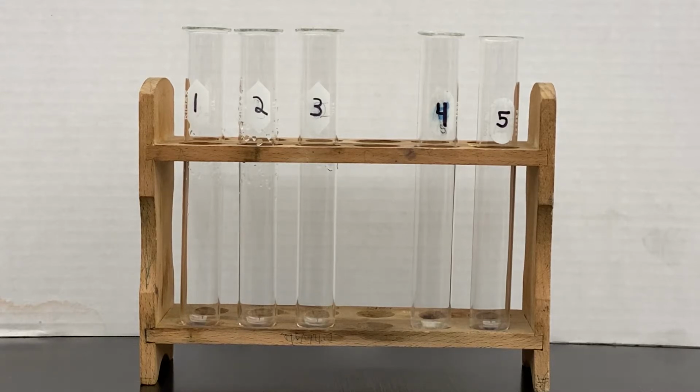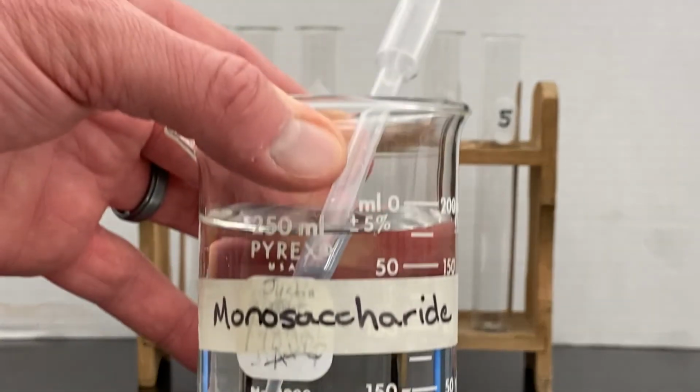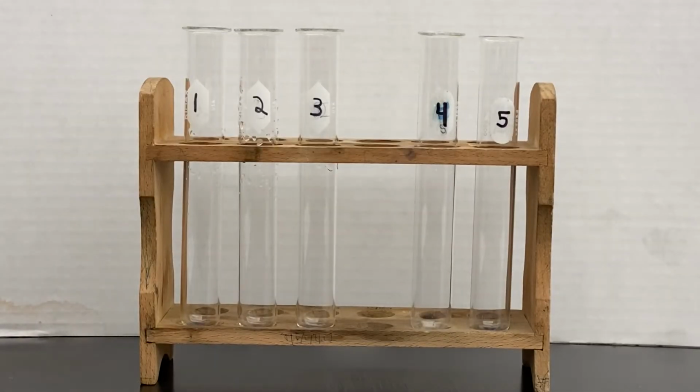So, first thing I'm going to do is take 3 clean test tubes. As you can see on the left-hand side, they're numbered 1, 2, and 3. I'm going to put 30 drops of monosaccharide in tube 1. Here's our monosaccharide, so we're going to do 30 drops.